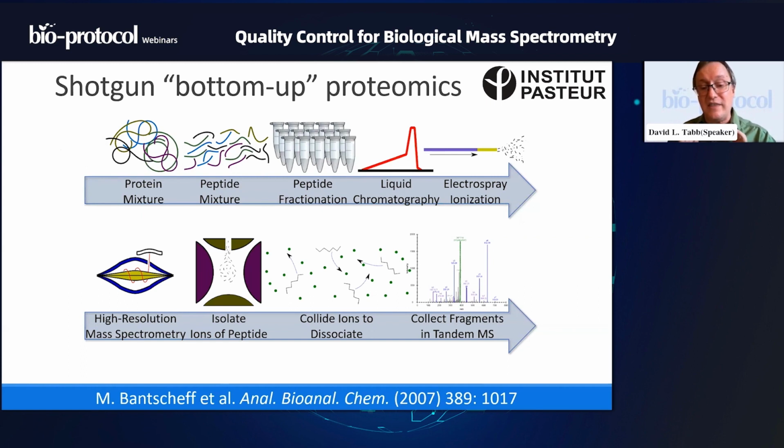So that ion has now been targeted by the mass spec to collect a whole bunch of ions in the trap, to cause it to collide with noble gas atoms, which cause it to gain energy until the mobile proton causes it to break into a B ion and a Y ion, most typically. And then those fragment ions, all the fragments that resulted from blowing apart a particular peptide ion, can all be cataloged in a single tandem mass spectrum.